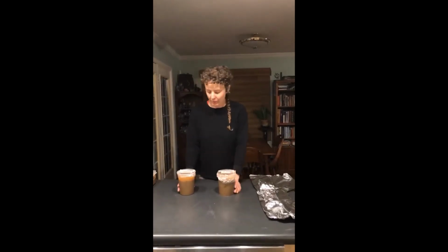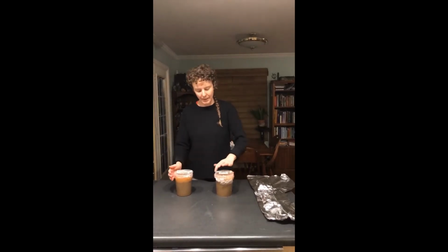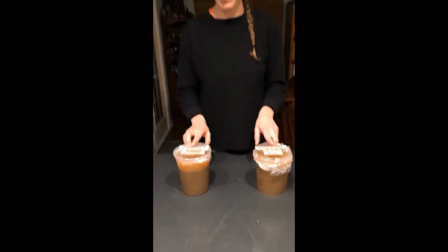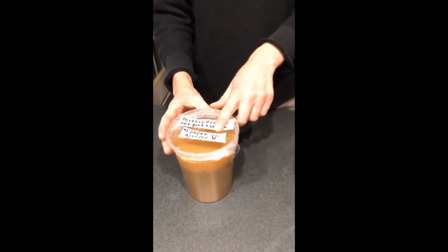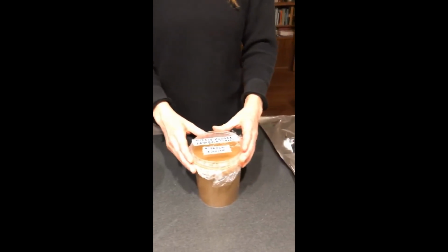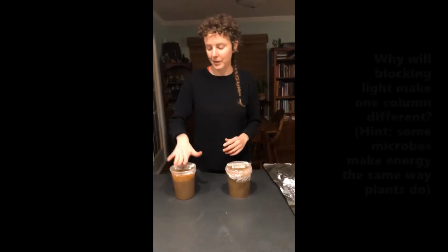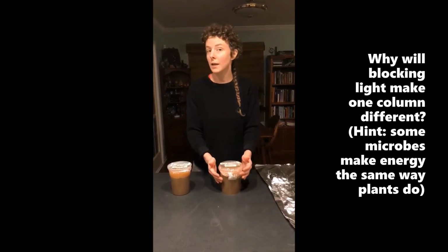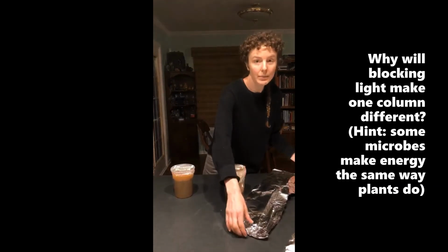Okay, so now we have both our columns made. We have our mud, our water. We covered them with plastic wrap and a rubber band, and then they are labeled with the source of our mud, our nutrient inputs, and then this one is labeled with a light bulb because this one will be exposed to the light. And then this one is our experimental. I mean, really either could be experimental and either could be control, but we're going to call this the control, exposed to the light. And this one, the experimental, we're going to see what happens when the column is not exposed to the light. And by covering it with tinfoil, we will accomplish this.